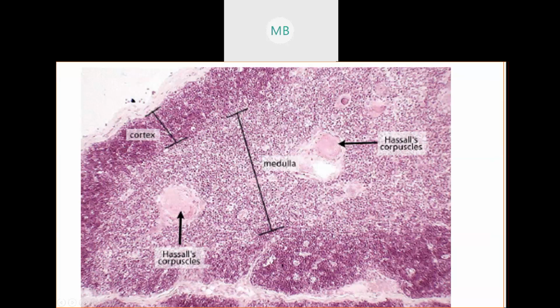Lymphocyte, which is also on your lab list, is another specific type of white blood cell. You're going to be asked to identify those as a white blood cell on like a blood smear picture. Don't worry about those ones for right now. Because remember, lymphocytes use your thymus as a dormitory. They grew up here.